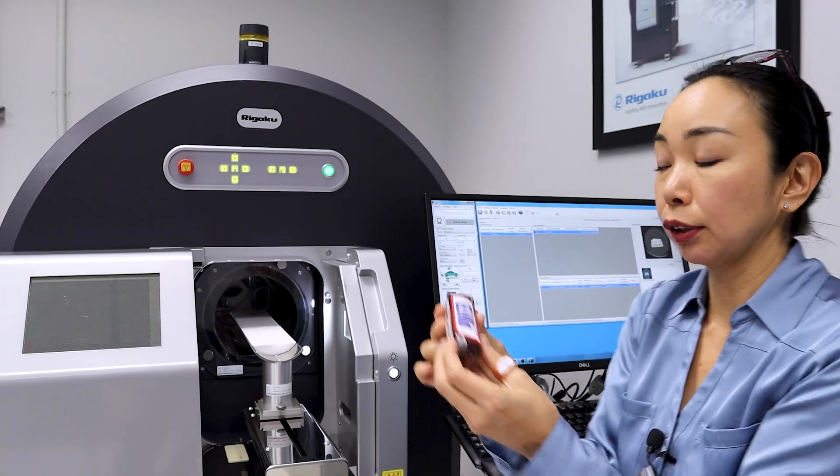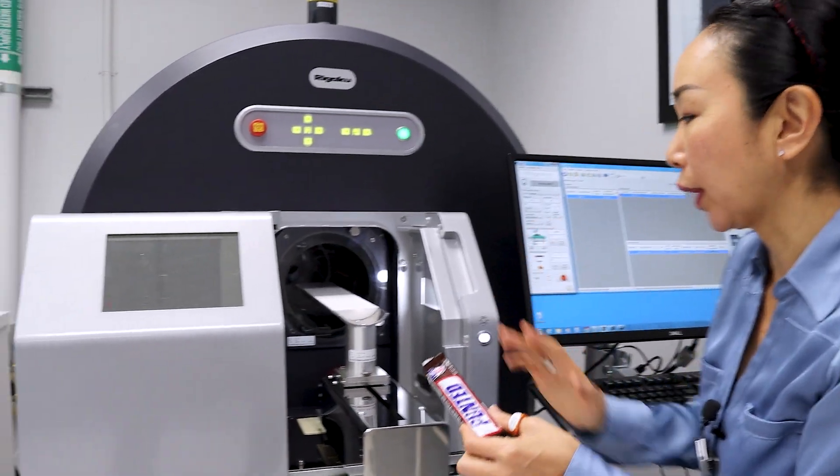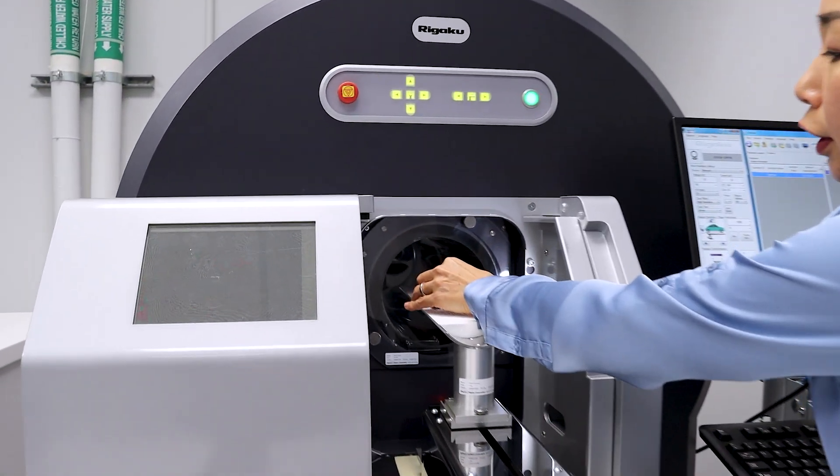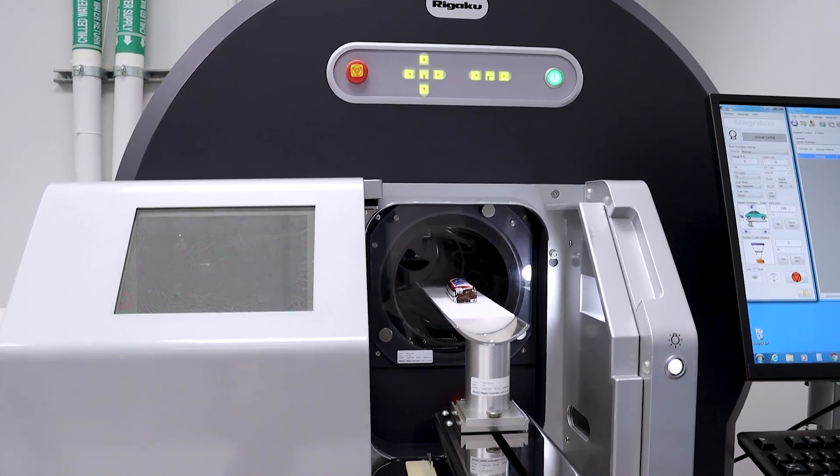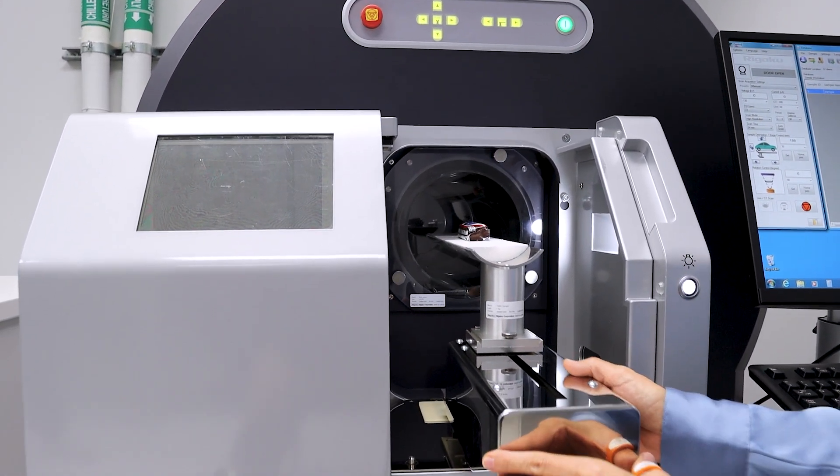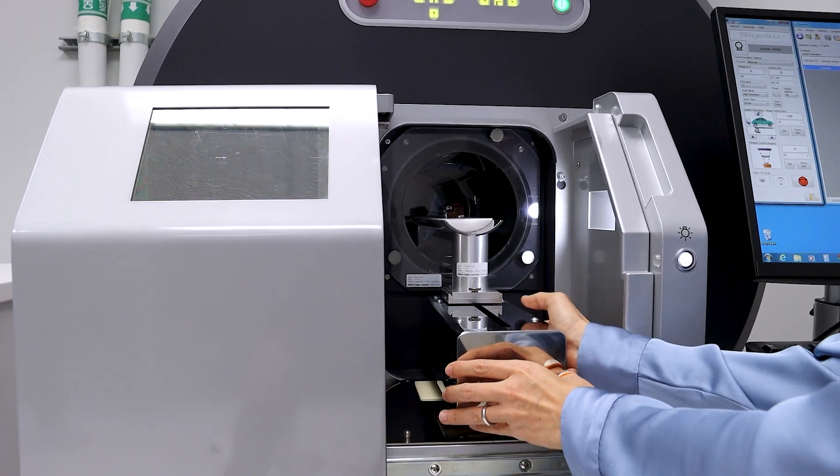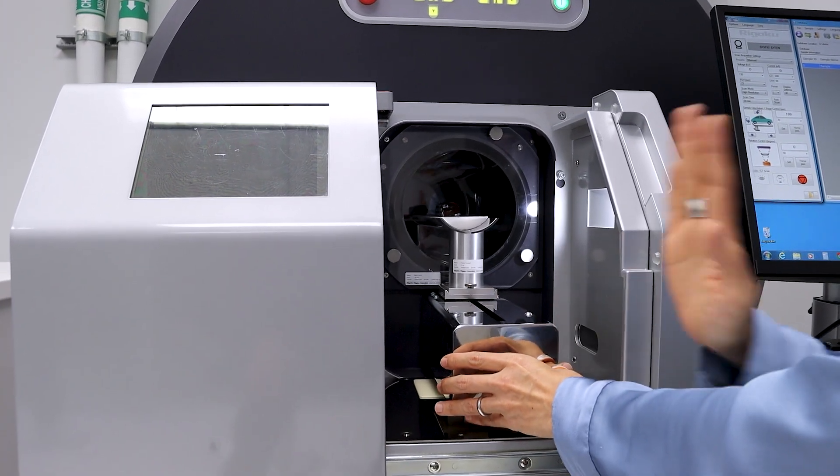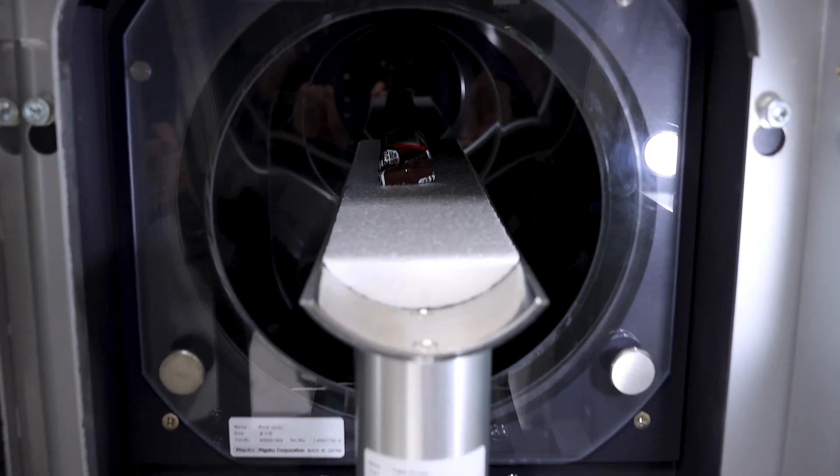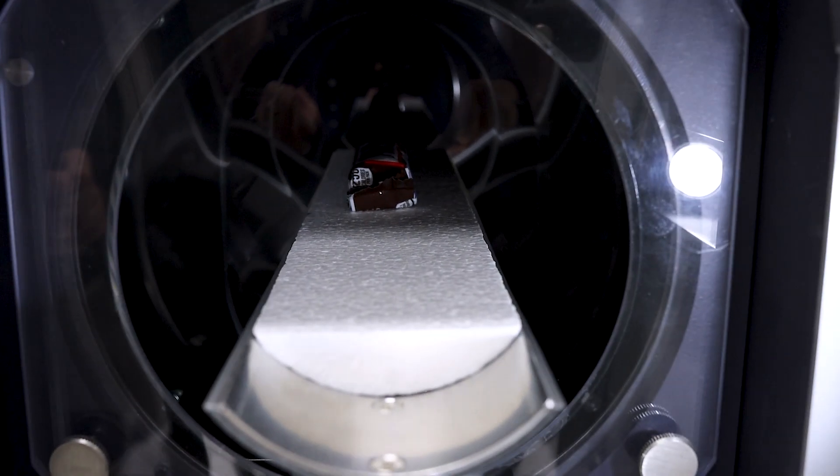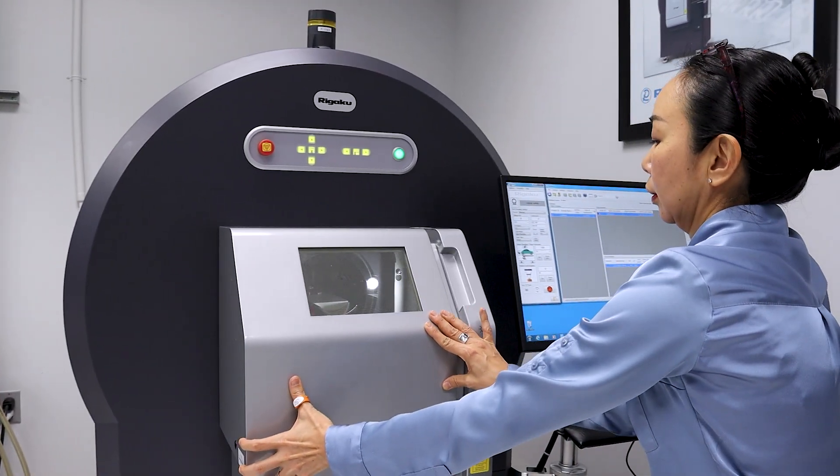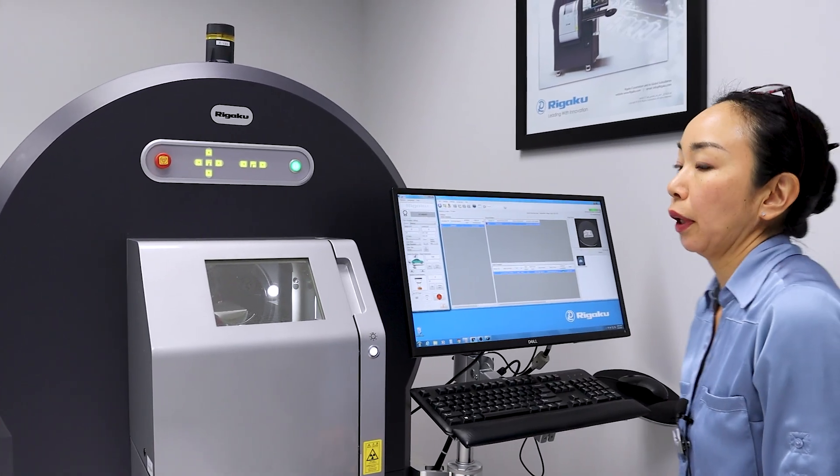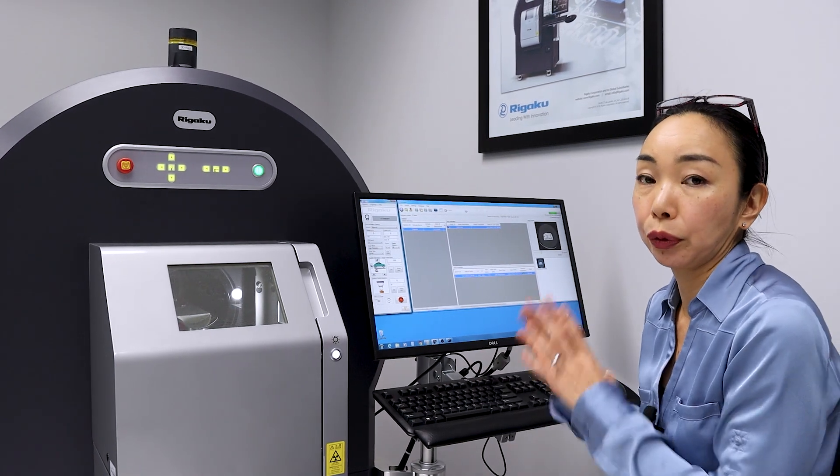Now, to set this on the machine, this is the beauty of the gantry system. You can just put it on the bed, and that's all you have to do. And you slowly slide it in. You don't need any double-sided tape or glue to hold the sample, because it's not going to move. So once the sample is set, you're going to do everything else pretty much on the computer.